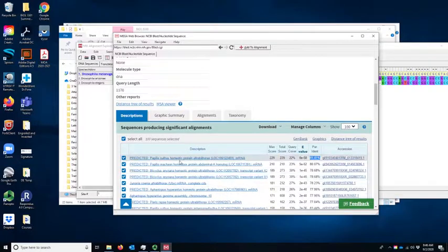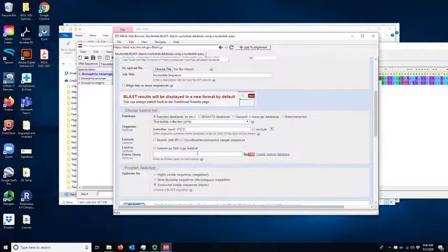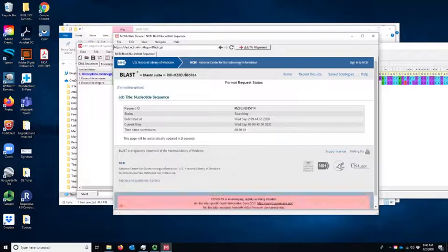this is the very best match that it could find among the butterflies. Now, if I go back and I do this search without constraining it, so let's just go back. I'll edit my search here. And I'm going to do it without giving it any constraints at all. Now, because this is a sequence that I downloaded from this database from GenBank, of course, it's going to return this sequence with 100% similarity. 100% match, 100% similarity, and the E-value will be 0. And then there will be other sequences, and because this is in melanogaster, there are many, many DNA sequences available for that species and also closely related species.